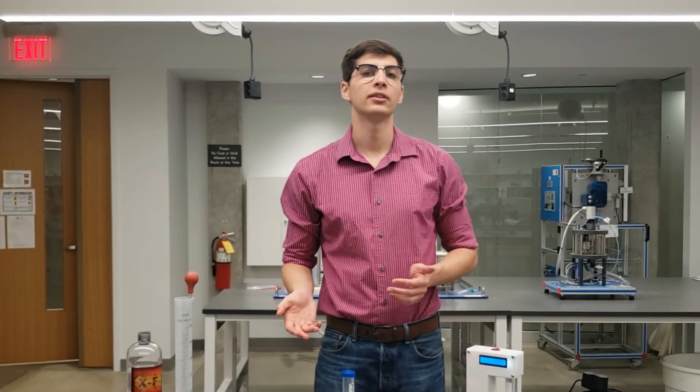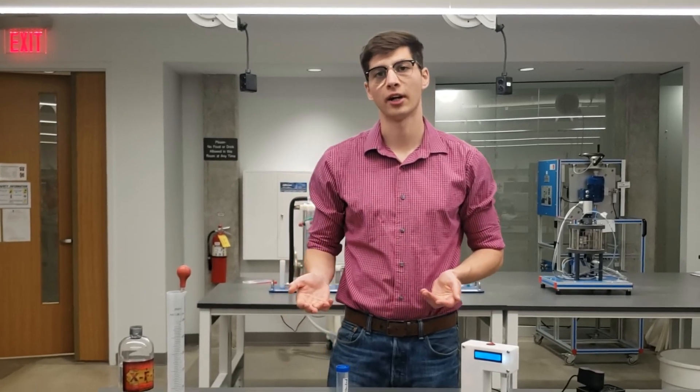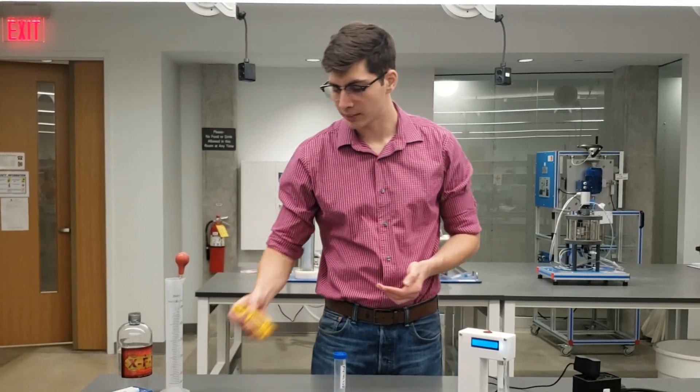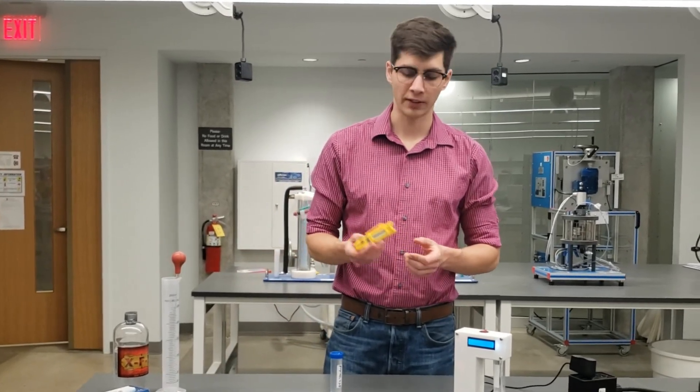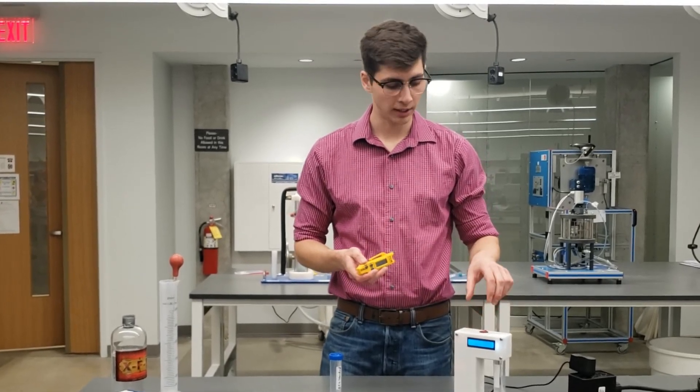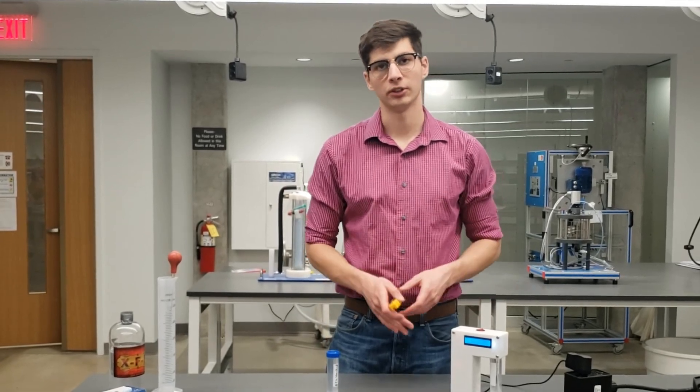However, there are a couple of pieces of equipment that I would recommend having that you probably already have laying around. The first piece of equipment that I would recommend having is a separate temperature probe. Now these are really cheap on Amazon, I think this was like $15, and there is actually an integrated temperature probe in the detector when you read your samples.